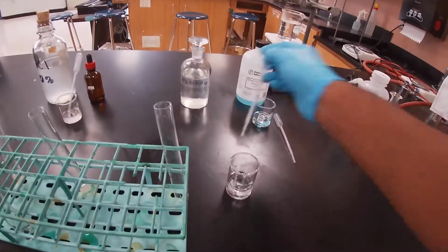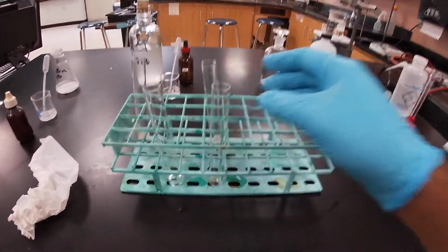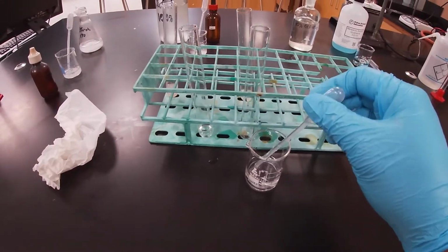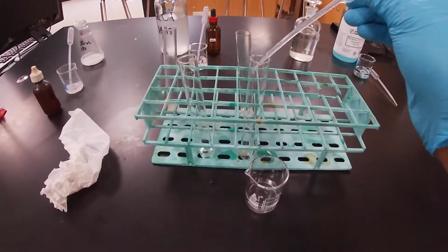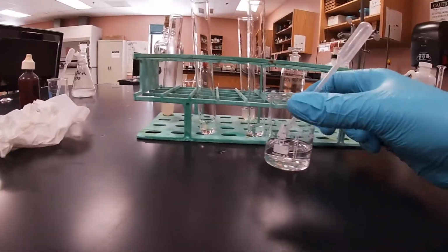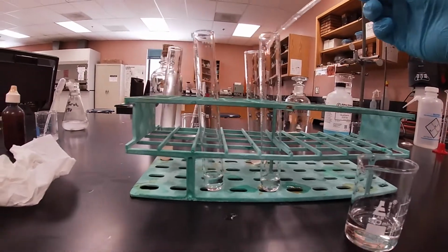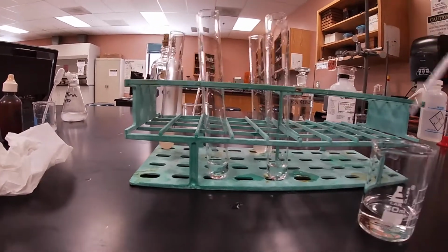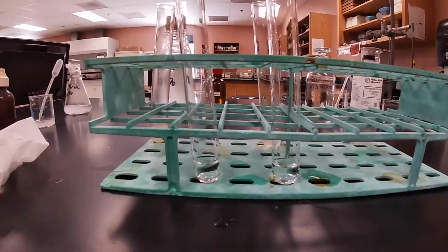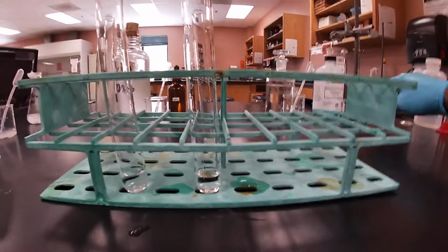And so we get our pipette, and we get our test tube, our beaker with our glucose solution, 10%. We're going to go ahead and add about 3 milliliters. I think we should have maybe a little bit more. I think we should be good there. We'll return our glucose solution. And if you notice, we're about the same height.